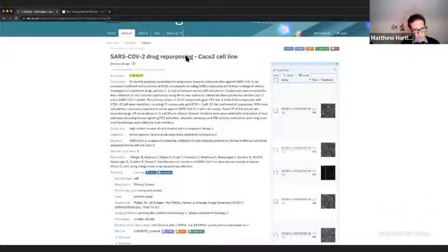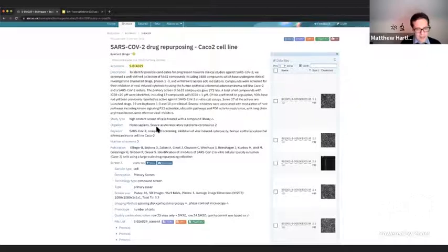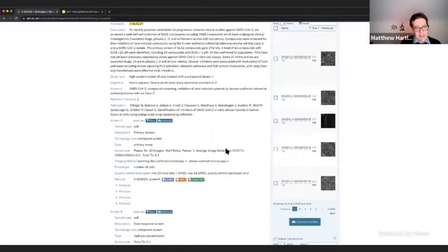So we see the title, there is a description, which is usually an explanation of the experiment that gave rise to the data set. Then we see more information, in this case, things like the organism that was being studied, or organisms in this case, and then some more information. And actually, what goes into this is dependent on the level of detail that the submitter provides. And that's why it's useful to explain this before we go through how submission works.